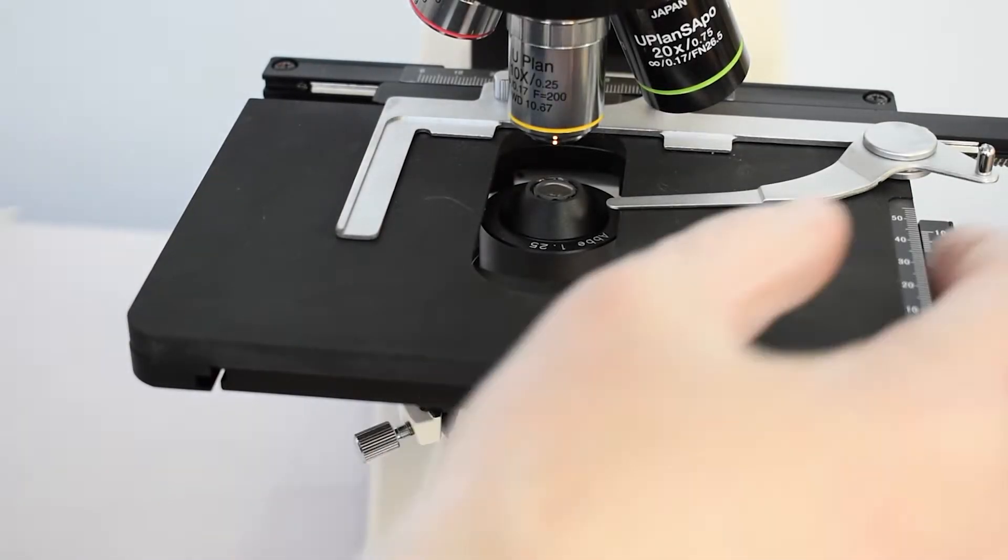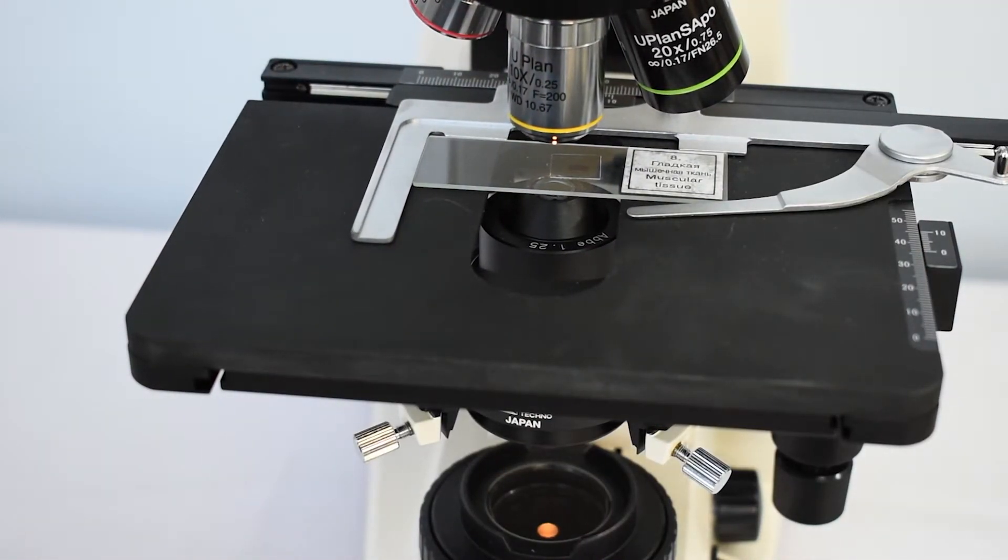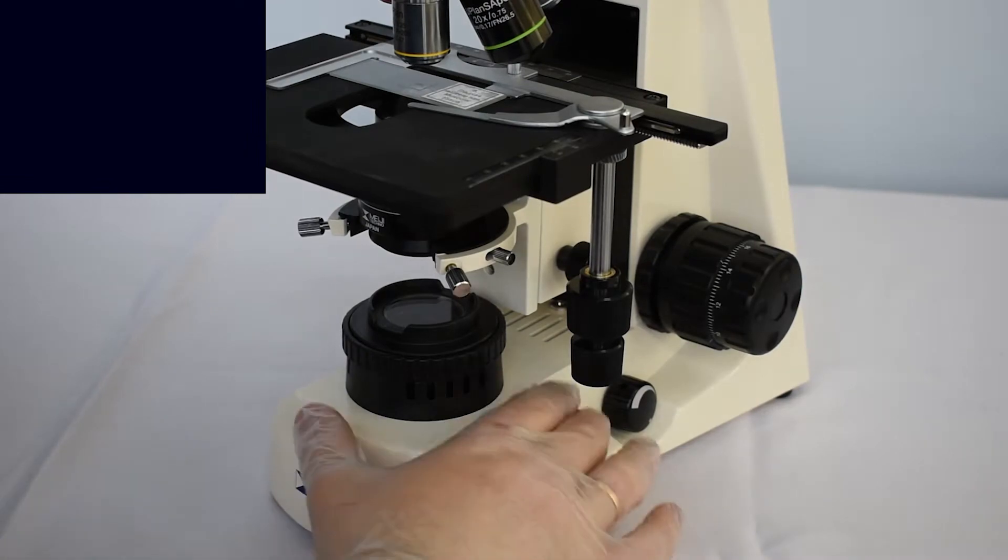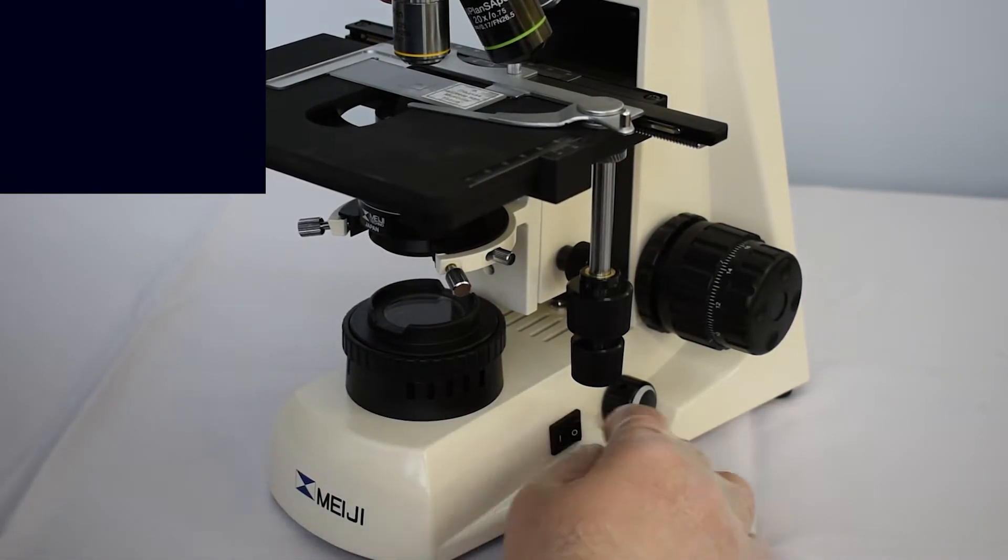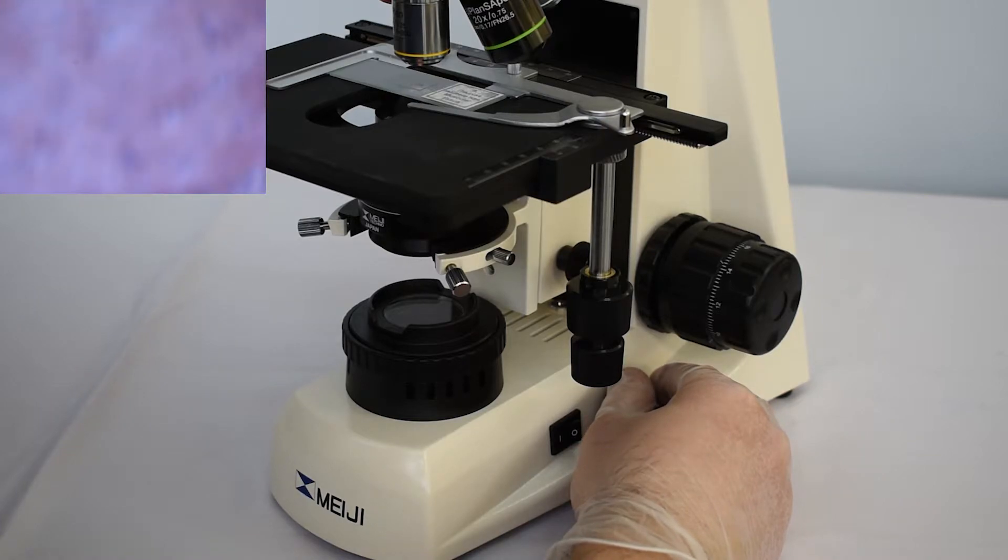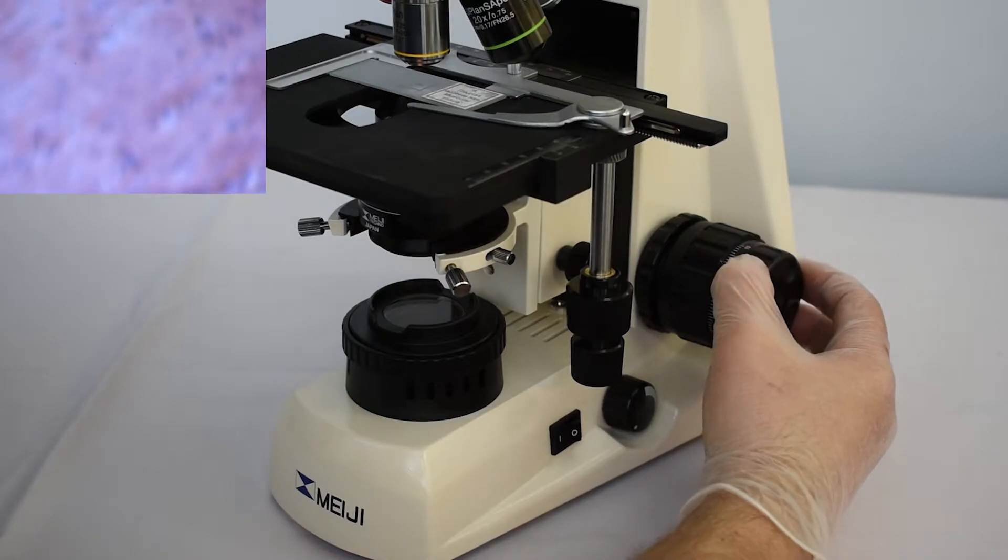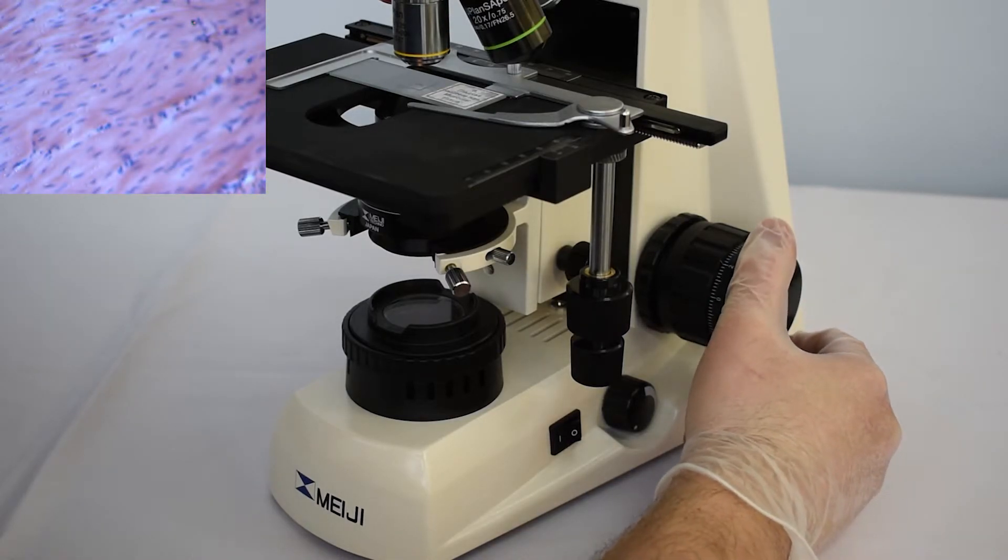Before starting work you should fix the slide on the stage using the slide holder. Then you need to turn on the microscope lighting, adjust the light intensity that is comfortable for your eyes, select 10x objective and focus on the sample using a micro screw.